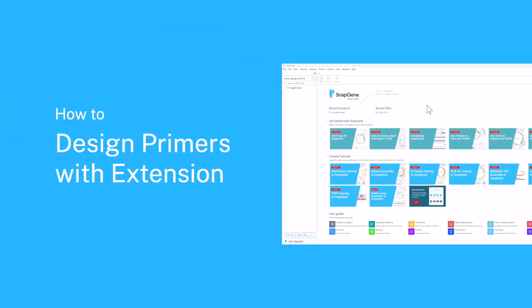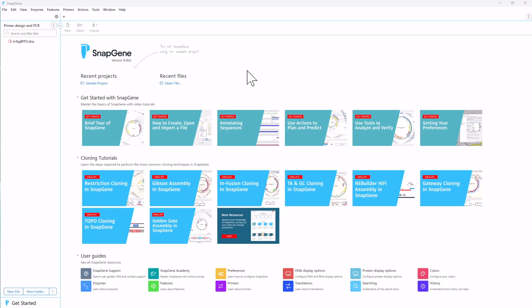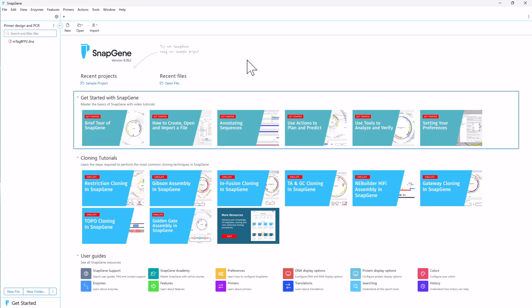Welcome to this video on using SnapGene to create primers to amplify a coding sequence and then using the primers to generate a PCR product. You will learn how to incorporate restriction sites into the primers as five prime extensions so the PCR product can be used in restriction cloning.